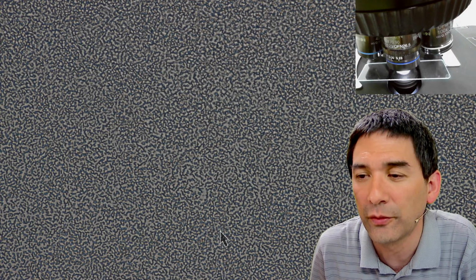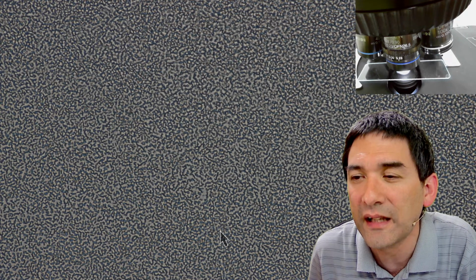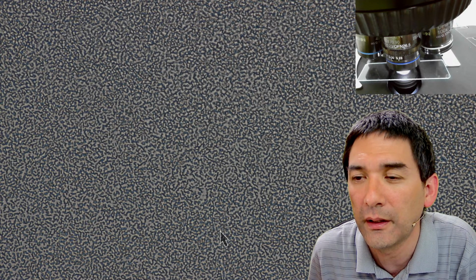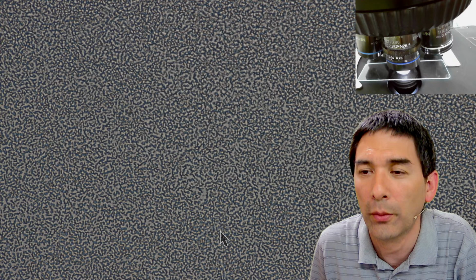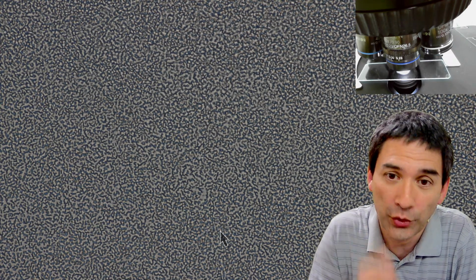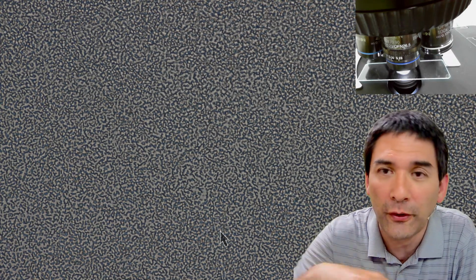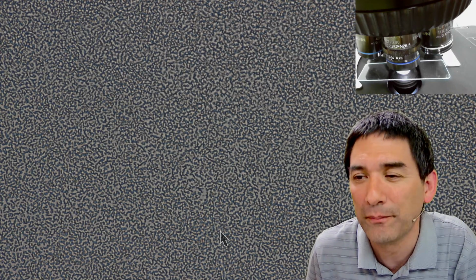Hello from Germany. I made my first spore print directly on a slide, and it worked amazingly. I added some 2% KOH and took pics of the spores. There were thousands. Basically, a spore print works like this: you take a mushroom and put it over a slide, and then you knock on the mushroom, and the spores will fall down on the slide. This way you're able to make a spore print.